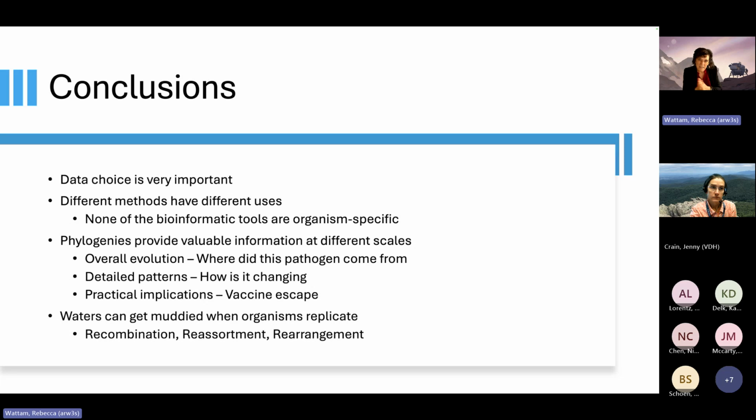I don't know that I've seen that people do that, but influenza, I just used it as a test case here. I haven't done a deep dive on it, although I'm interested in it because it is so crazy. But you can get the sequences for them, and then when you build the alignment, you just put them on it too. So you can look at two genes at once, do a multi-gene approach, but most people look like they do one or the other.